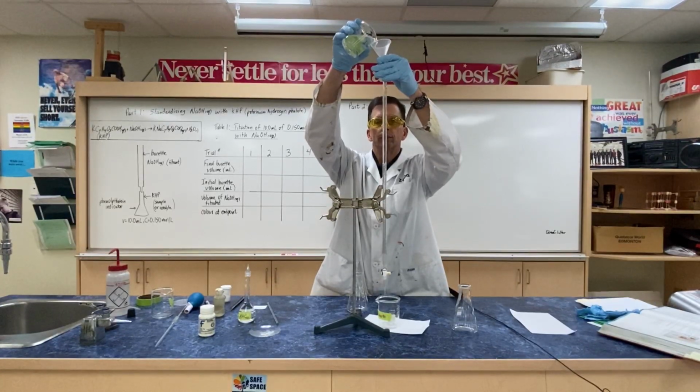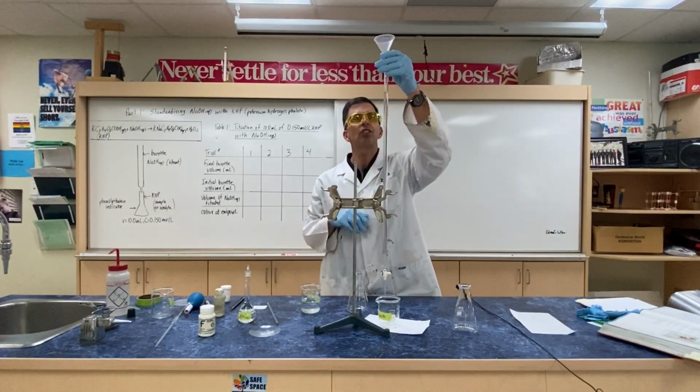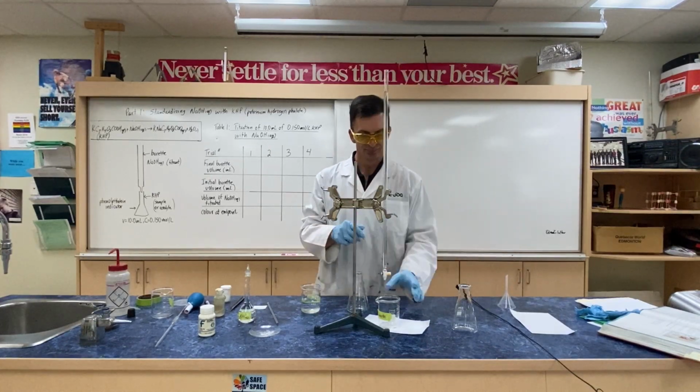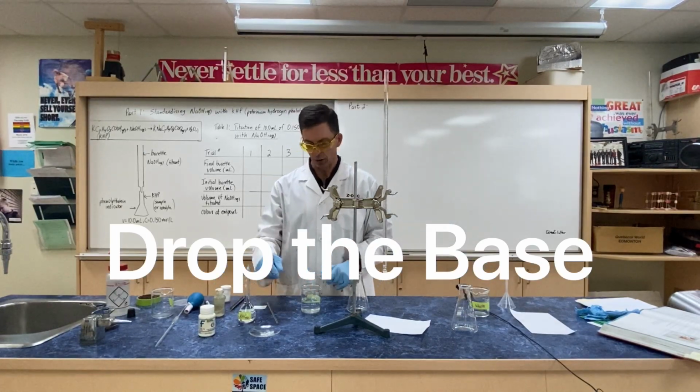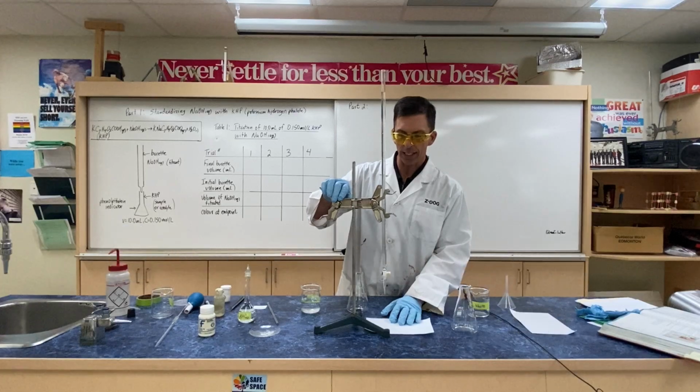Is this a step that some kids don't do carefully and they overfill it? They overfill it. That happens every semester, or the stopcock is not put on properly, and it falls out, and the whole lab bench is flooded with base. So you're literally dropping the base. Yeah, dropping the base. Boop, boop. All right, so our titrant is ready to go.